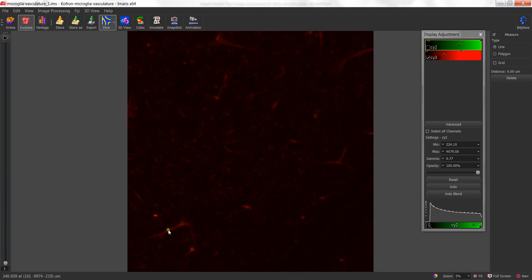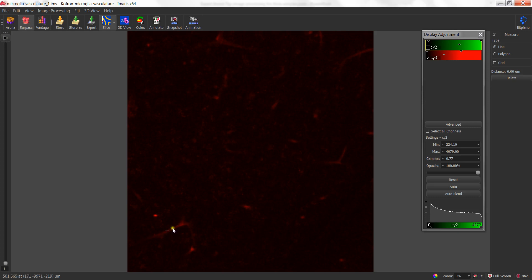If I move my cursor onto a blood vessel, the numbers changing in the bottom left-hand corner represent intensity value. The first value, 344, is representing the Cy2 intensity value, and the second value, 703, is representing the Cy3 intensity value. What I want to do right now is locate a ballpark estimate for the contribution of intensity for blood vessels at the bottom of the stack. By moving my cursor up and down that blood vessel, it looks like my intensity value is around about 600 gray levels.